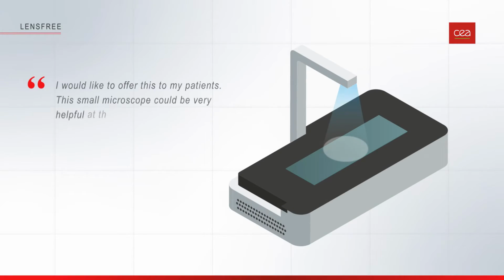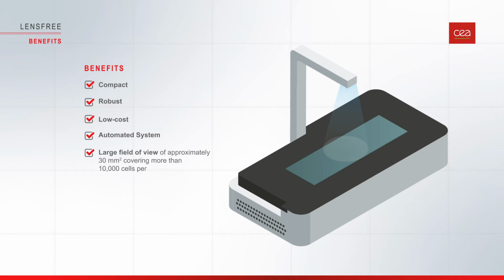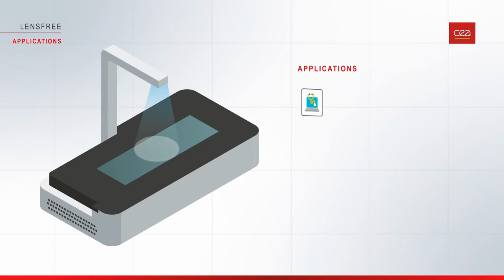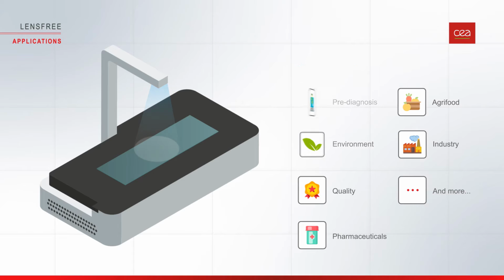And it is also completely automated, so it is a non-dependent measurement. It does not depend on the operator that made the measurement. I suppose the other part of this is the artificial intelligence in the background to identify these things, right? Yes, there is an artificial intelligence algorithm directly inside the system, so as to make the classification, the detection, and also to count the objects that are visualized on the image that is acquired.